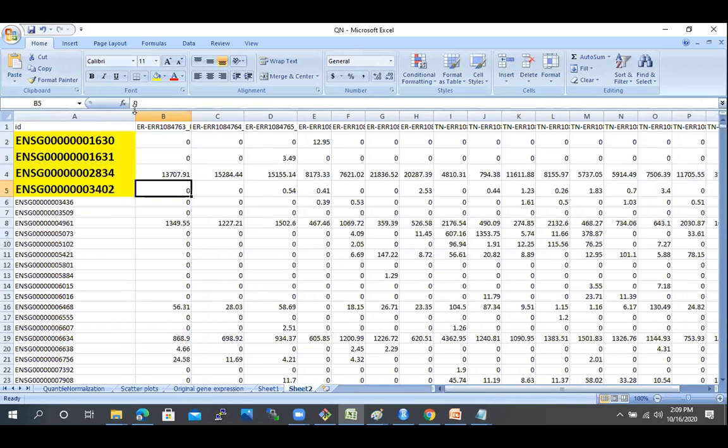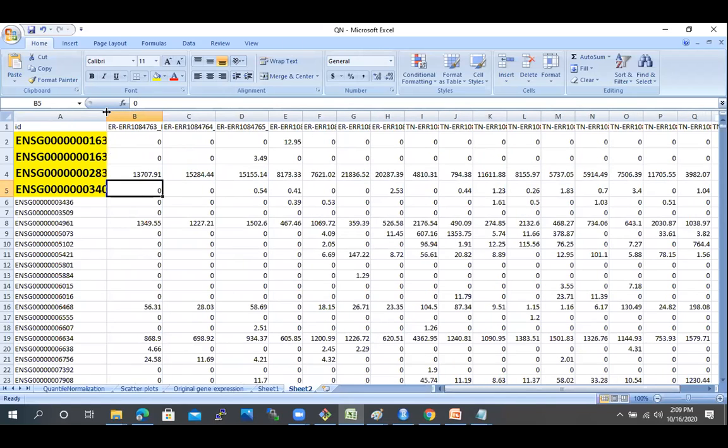Just write your answer, post your answer in the chat. So eventually, by running that pipeline, you will be able to obtain this gene expression table. Anirudh, yes. Okay, Sreshi, everyone. So far we have discussed how we can pre-process our data from raw reads to this structured table. Once we have this data, we can perform any kind of analysis.